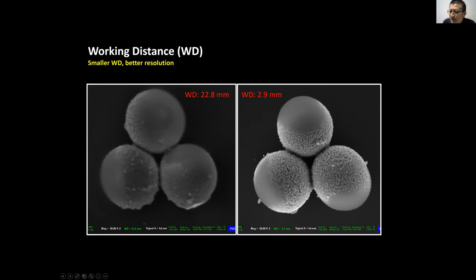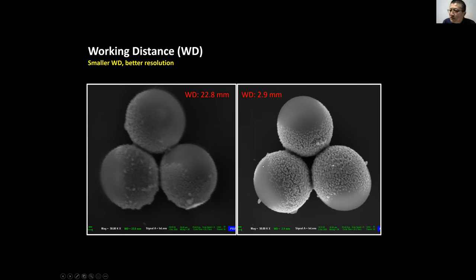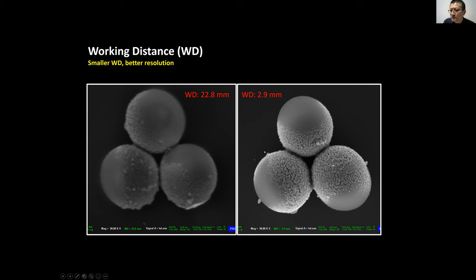Let's compare the same sample imaged at two different working distances. The left side uses a very large working distance; the right side uses a small working distance. Comparing the two images, the right side is much clearer. A clearer image means a smaller beam size. When you change the working distance, the beam size changes accordingly.